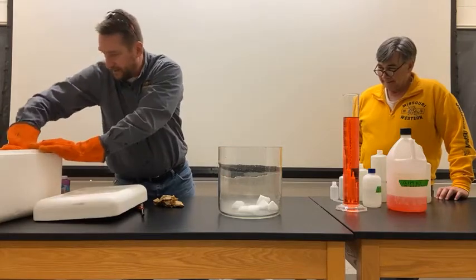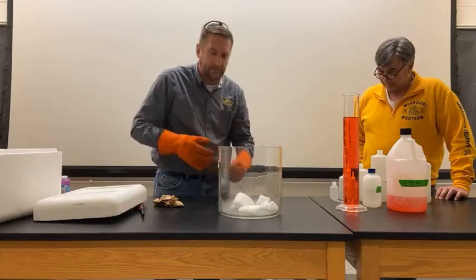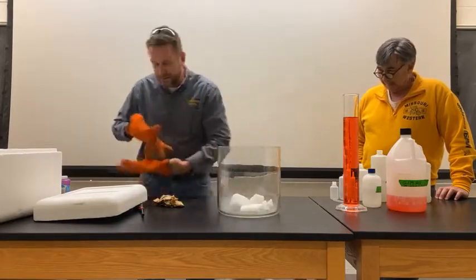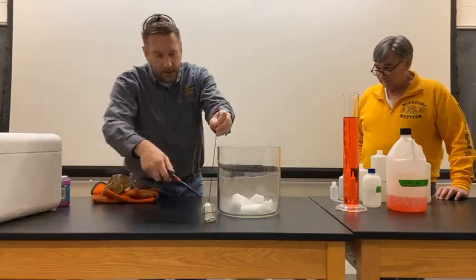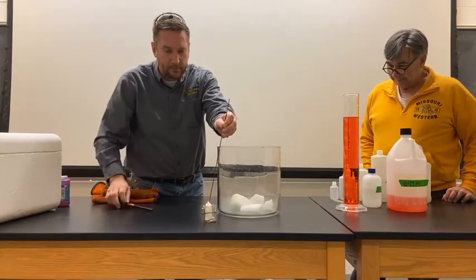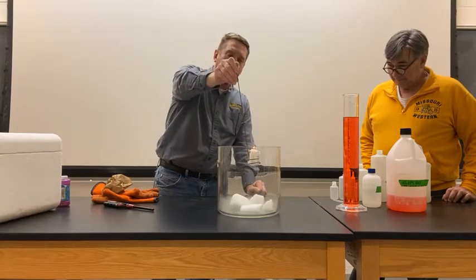Another piece out of there. That's it. Yeah, I really should have smashed it up a little bit better so that we filled it up more quickly. Let's try again. Let's see where we're at. Light the candle again. All right, I bet we're pretty much at the top at this point.